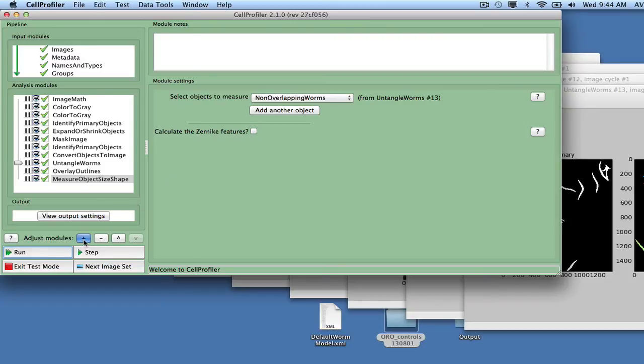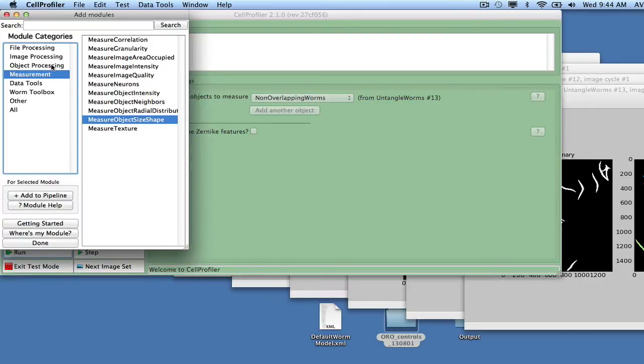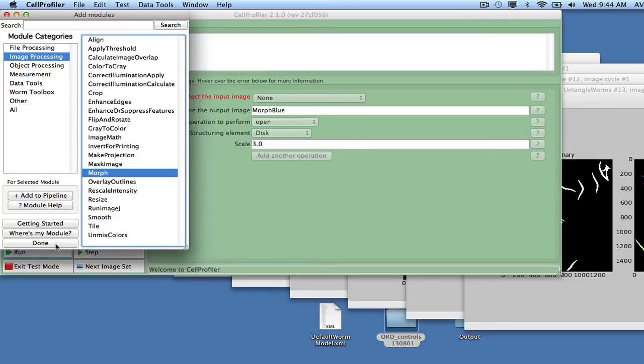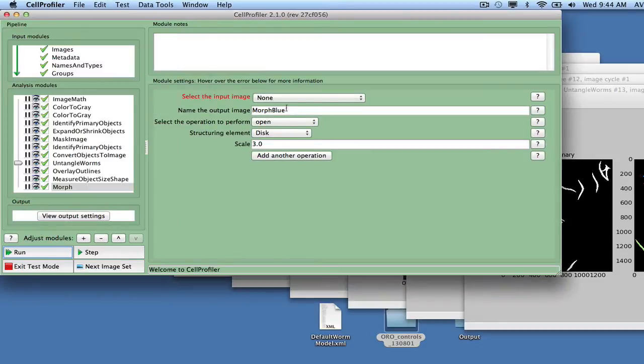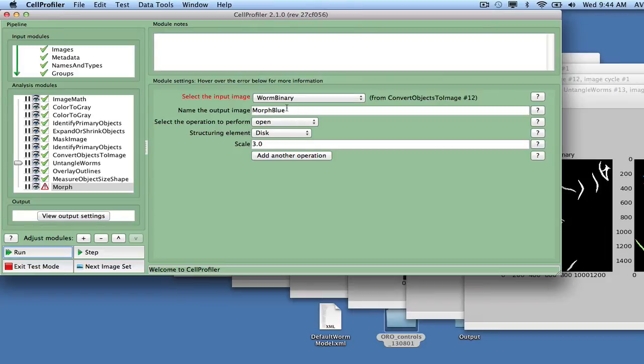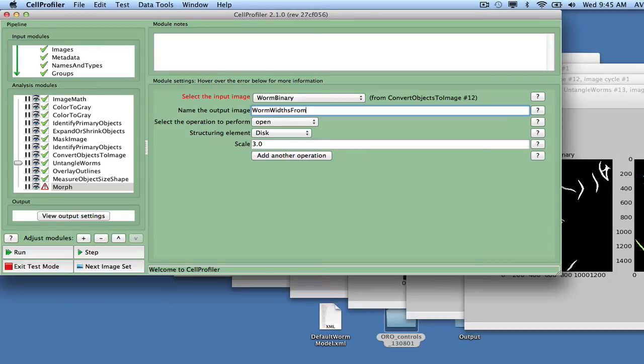Since the true width of the worms will be biased by the width of the worm model, we want to extract the actual average width from the worm objects. We achieve this by using the Morph module in order to calculate the distance transform of the worm binary image. Select Distance as the operation to perform and call the output image Worm Widths from Binary.